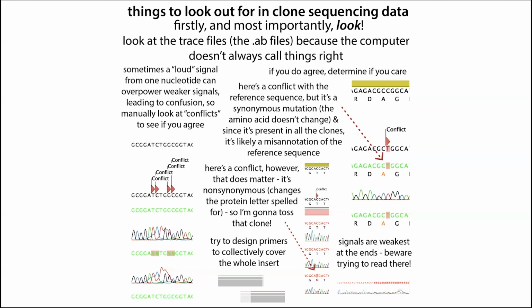Sometimes you might find that it's something your lab mate was working on, or it's just some really random thing that you have no clue how it got there. Sometimes you can have the sequencing company run it again, because there might be an error on their end where they give you someone else's results. But sometimes it really is that your plasmid has something random in there and who knows where it came from.